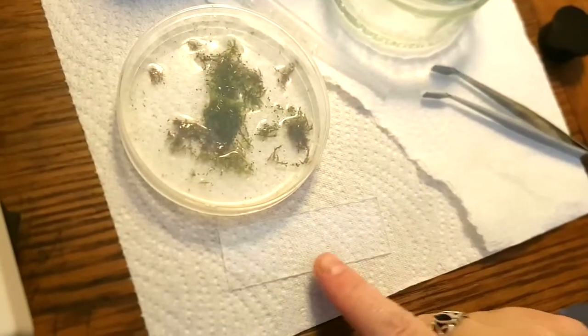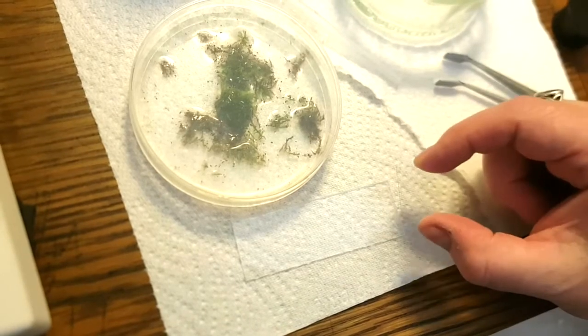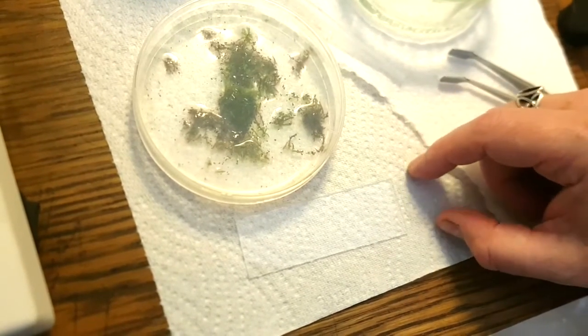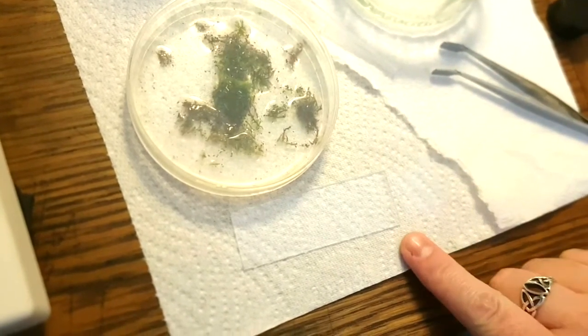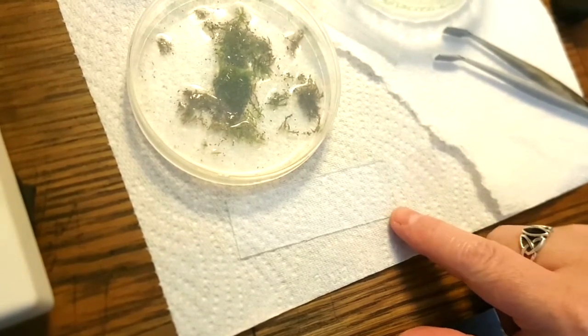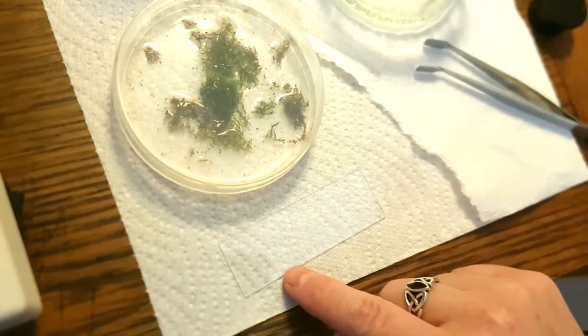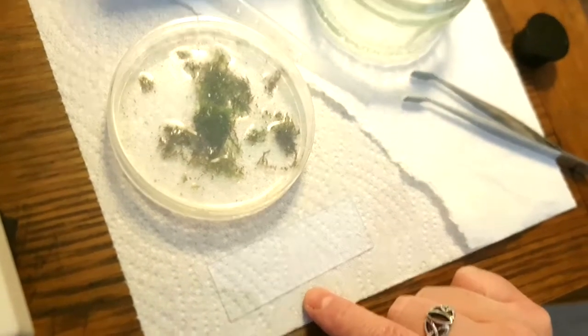Okay, so I have a microscope slide here and I've also got a little cover slip. Now, these are very thin glass, so please be careful with them because if they break, you will cut yourself on them. My microscope slides are very cheap ones as well, so they don't have the rounded corners, so they can be a little bit sharp as well. So if you do have these, please handle them very, very carefully.